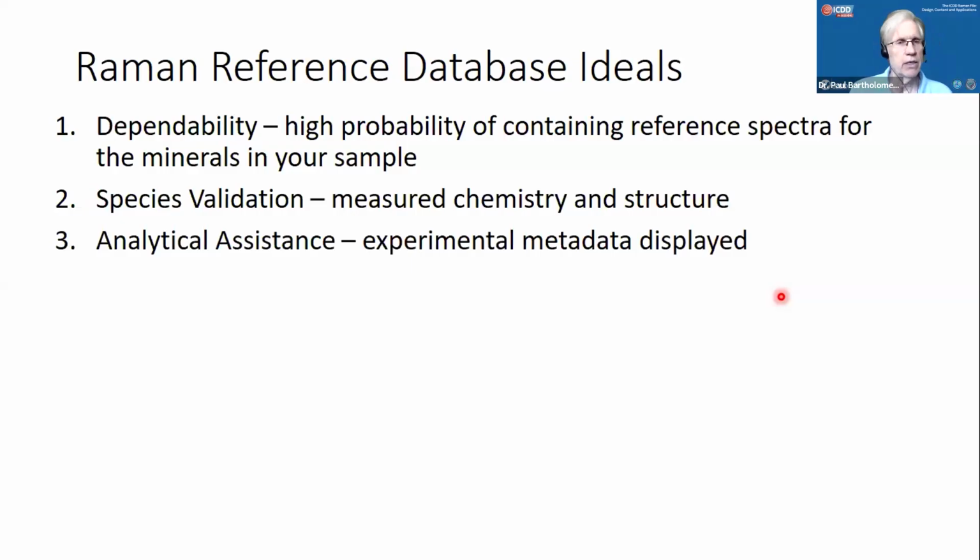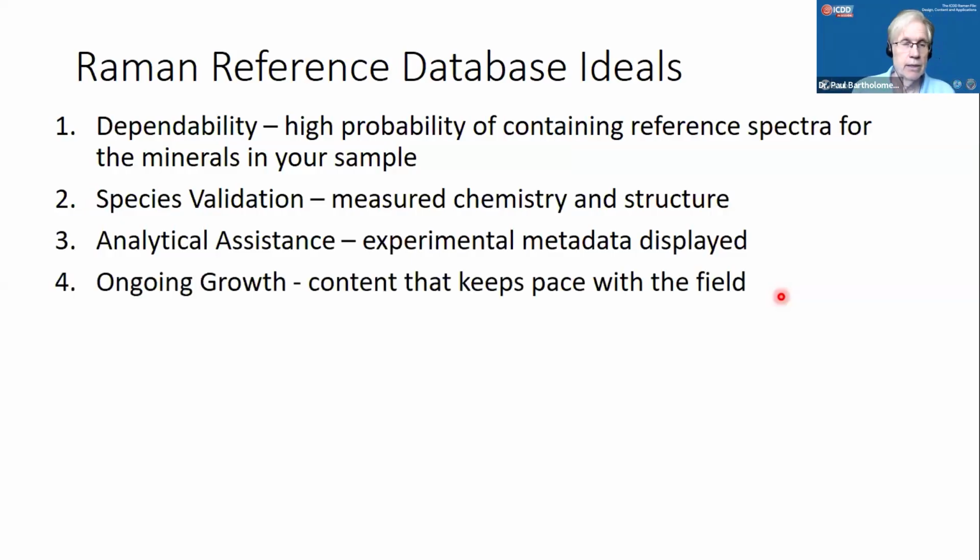Ideally, there's analytical assistance in the form of experimental metadata, so that people can look at what's in the database, look at the experimental metadata, and drive their own operating decisions based on what they're going to be analyzing.